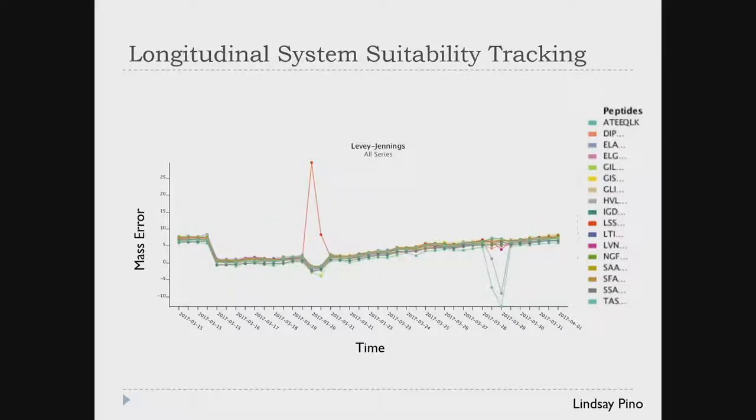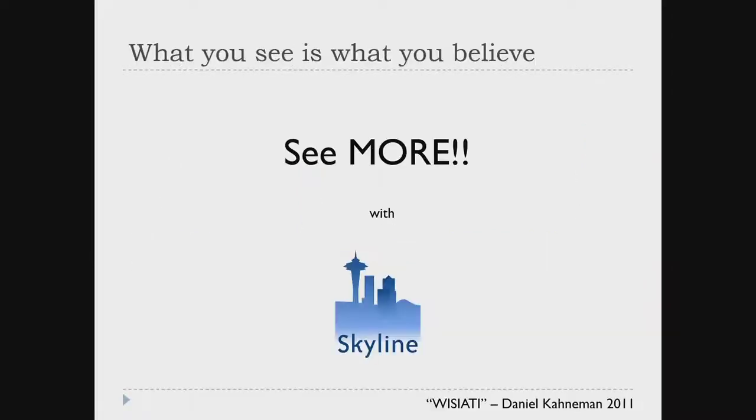And then this is one that I really liked, which was she's measuring mass error, and you can see it's up to about 7 or 8 here, and she recalibrates. And then, well, we get a little crazy again with a couple of peptides when the sample vial's gone. But basically it drifts back to almost 10 mass error. So you could track that and get alerted when that's happening, and maybe recalibrate before you get quite as far out again.